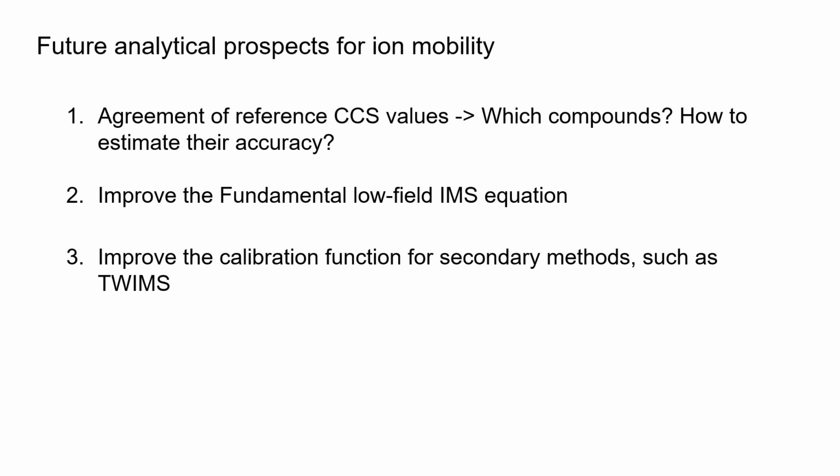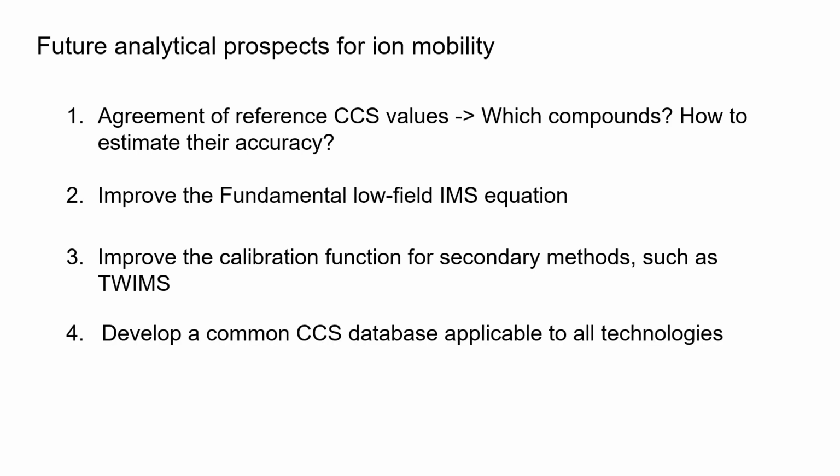And it could even be that secondary methods, properly calibrated, could show better performance than primary methods. Another consequence of finding proper reference standards would be the possibility to create a common CCS database for all platforms, vendor neutral and applicable to any technology.